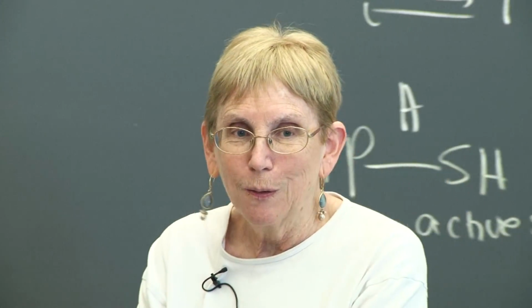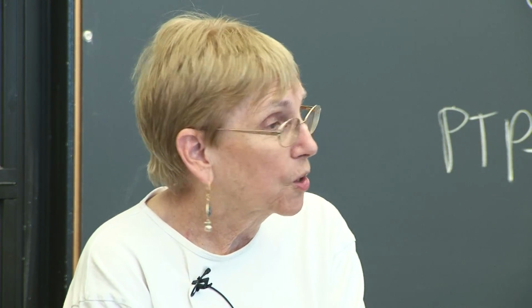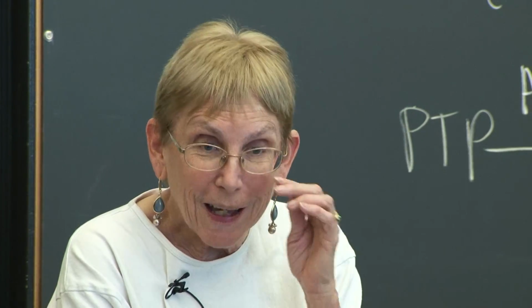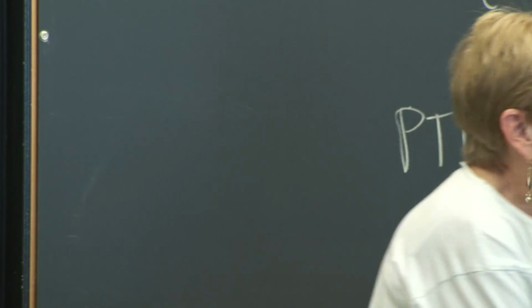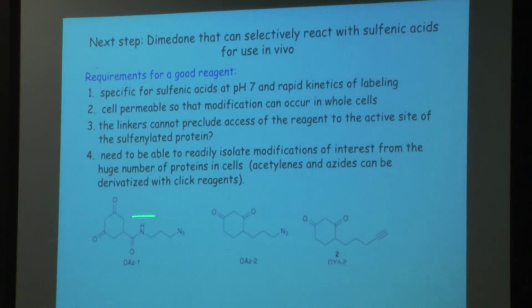That this doesn't alter the sulfenylation profile in any way? Well, you have to be able to sulfenylate first. Okay, what governs sulfenylation? If you look at these molecules. So you sulfenylate. Let's assume you can sulfenylate. We can't control that. If you've got hydrogen peroxide in there, if you generated hydrogen peroxide, so they've somehow got to do that, and you sulfenylate, or maybe they don't. They did EGF stimulated reaction. Then what do you have to worry about with respect to these analogs?